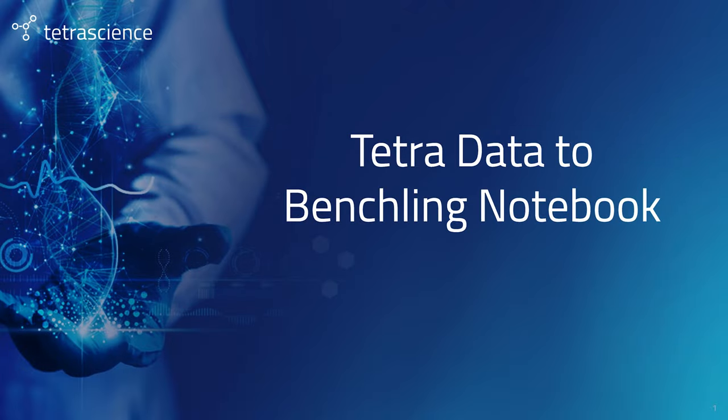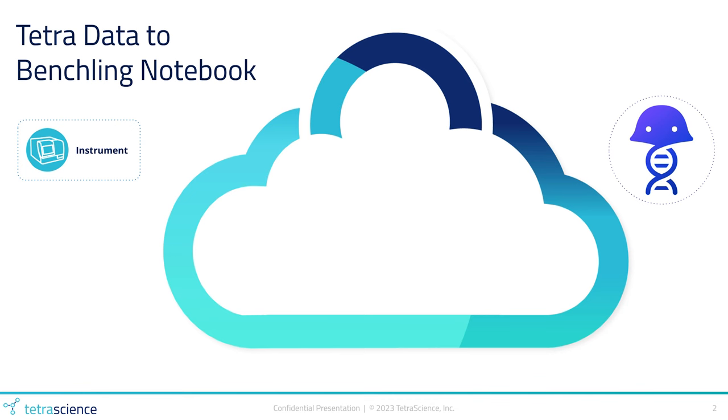I'm Ian Cooper, integrations architect at TetraScience. Today I'm going to talk to you about how we can get Tetra data into Benchling Notebook as assay results.